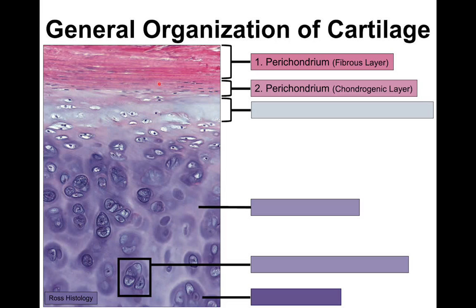It mainly consists of chondroblasts, which are derived from fibroblasts. These chondroblasts undergo cell division and give rise to new chondroblasts, and at the same time they produce matrix. These two processes result in appositional growth. So this area indicates a growing cartilage, or its appositional growth.